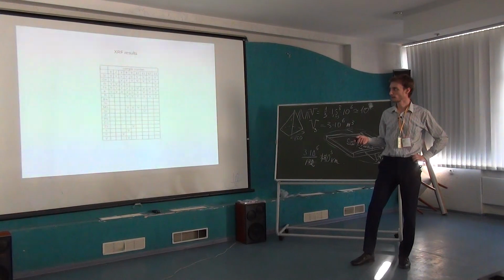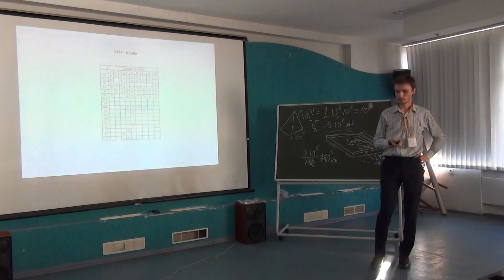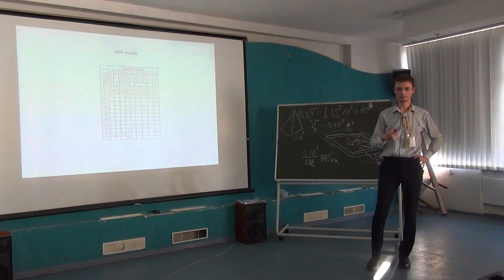Also, we did XRF, but it was made on a spectrometer from the Learning Research Center, the center for laboratory works for the students.